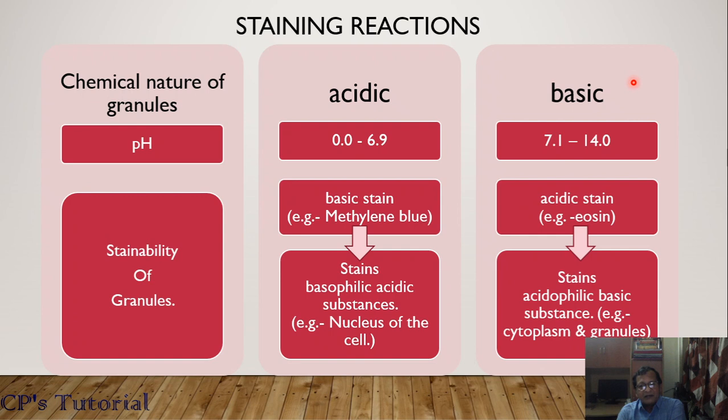So we now require to stain these particles. When both characters are there, we want a stain which can stain the acidic particles and simultaneously stain the basic particles.